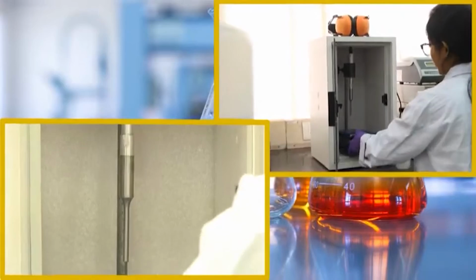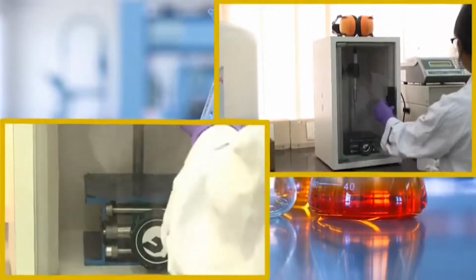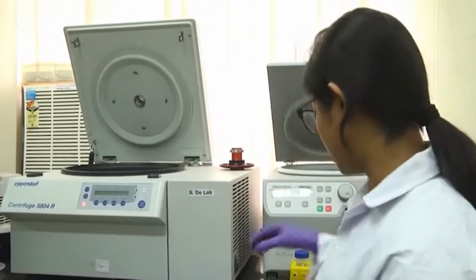If there is any kind of spillage, you should always clean it here. Close the door and we will switch off the machine. So, now we will go for this gross fractionation of our solution.